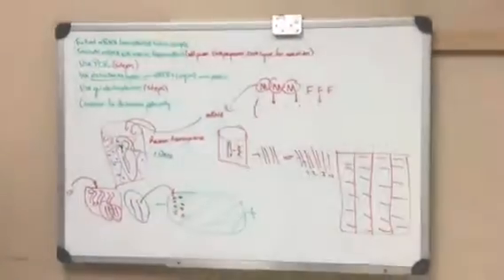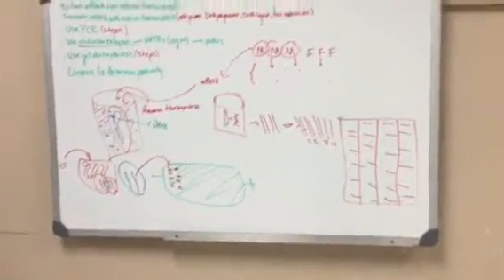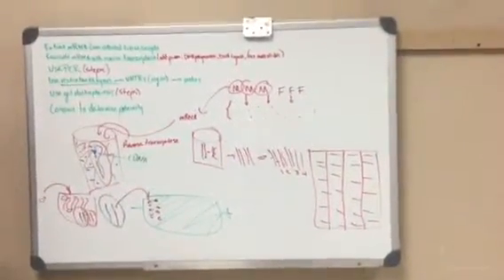We're going to add glycerine in order to weigh the DNA molecules down. We're going to add glycerine to do the phosphate bond.